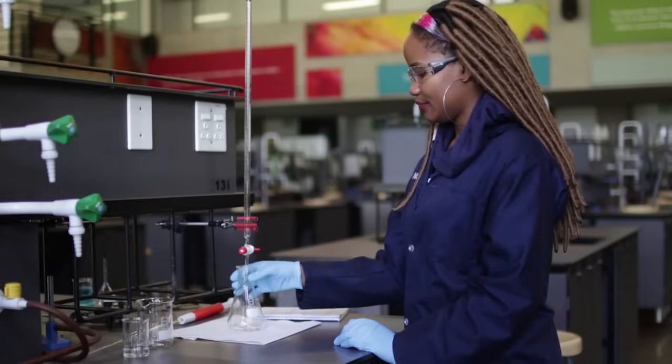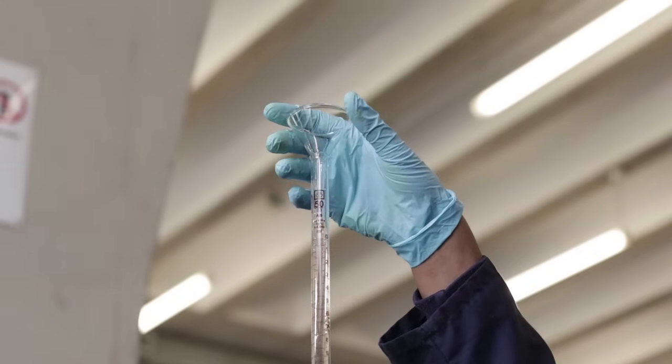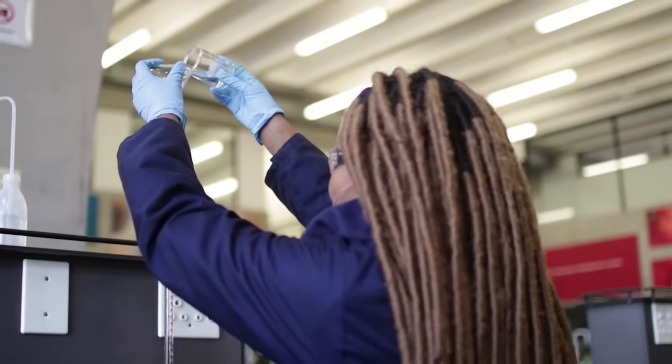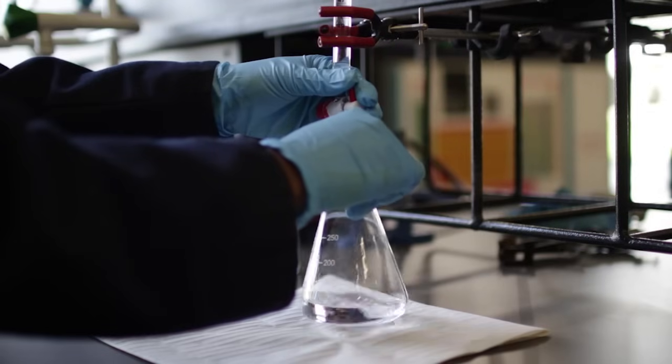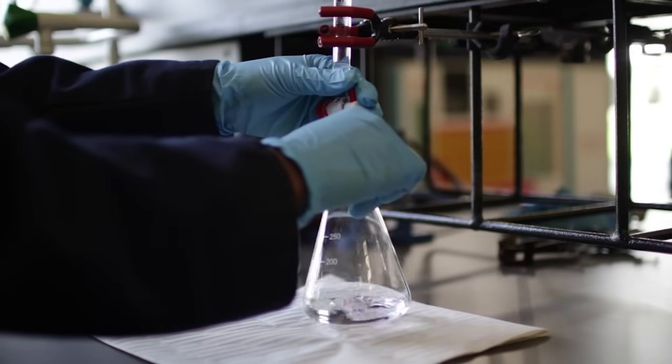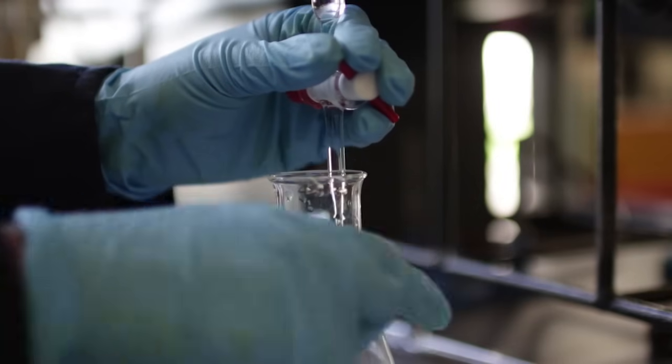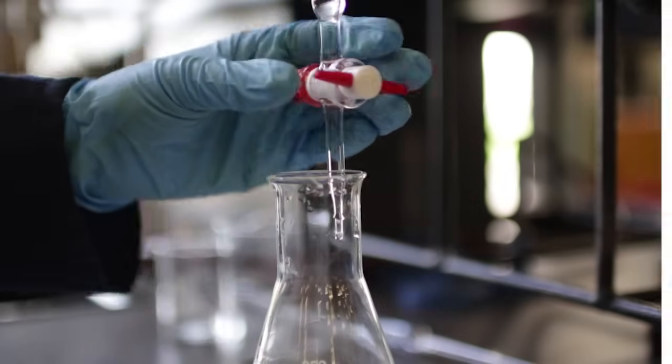The accuracy of the results of your titration will be a reflection of the care you took while performing it. When done carefully, titrations give very accurate precise results. Here is a step-by-step procedure required for performing successful titrations.